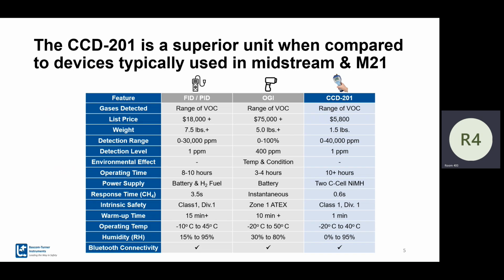As we enter this space, we are learning with you and our customers and prospective customers about what makes sense. When we came out with our calibration procedure, we said, well, when we play lawyer, we don't necessarily interpret it this way, but the reality is, we were too clever by half in our implementation, so we'll be one quarter as clever, or maybe 1.5. The way the FIDs calibrate, you have to put those points in to pull them in the range, because they are not linear. But since y'all are linear, technically, yes, you're right, scientifically you're correct. But lawyers are the reality of what we deal with.